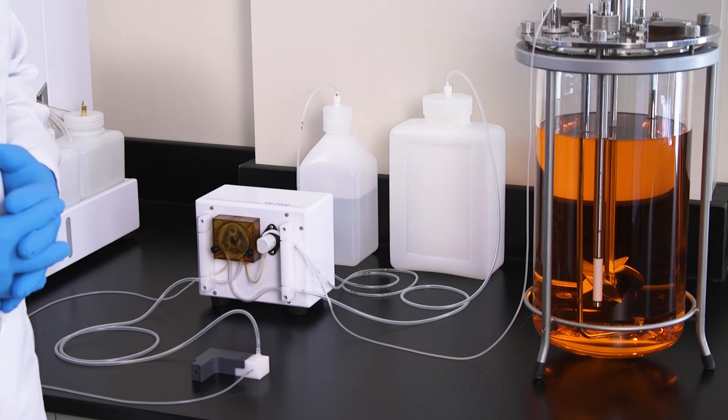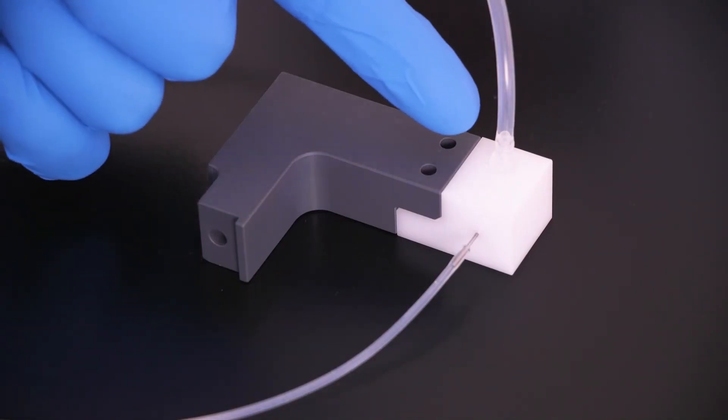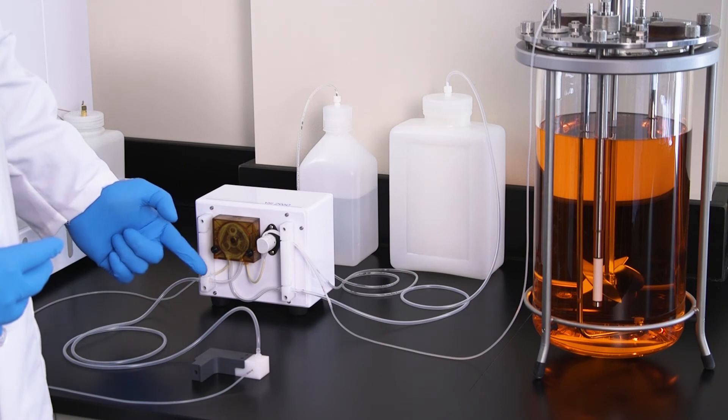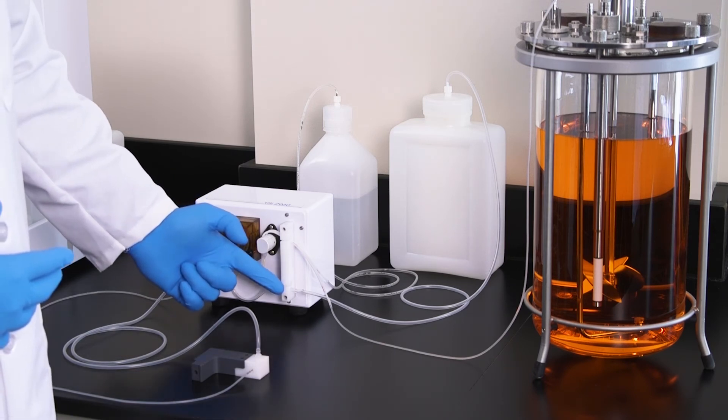The larger diameter tubing should run from the waste outlet of the sample cup, through the front roller of the peristaltic pump, and onto the connector for the waste bottle.